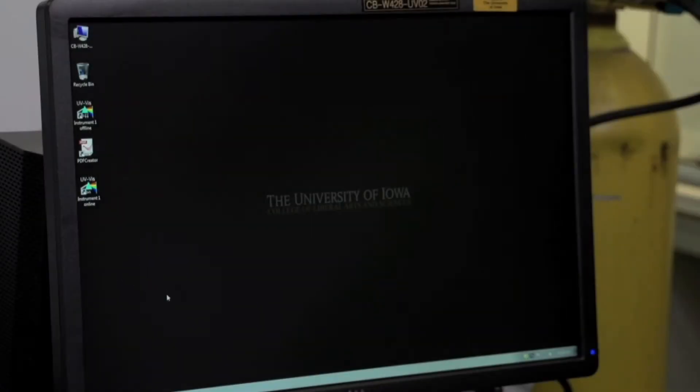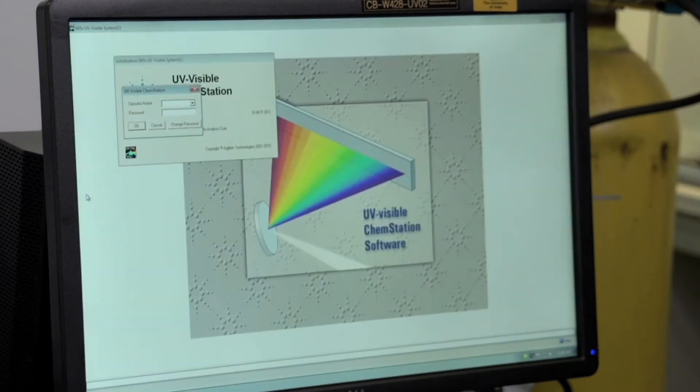To turn on the software, select the online version of the UV-Vis instrument. And when the dialog box prompting an operator name and password comes up, select cancel.